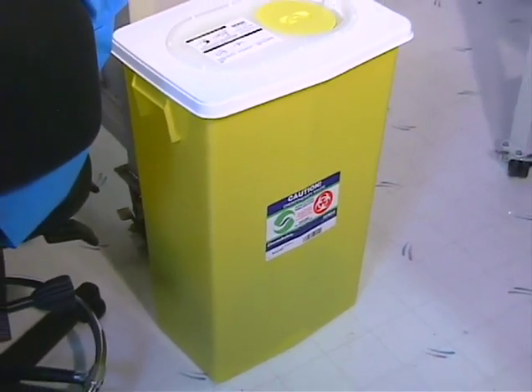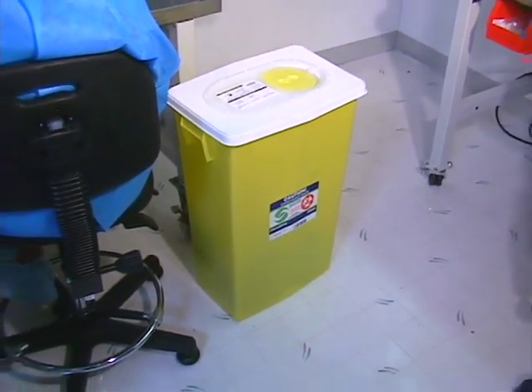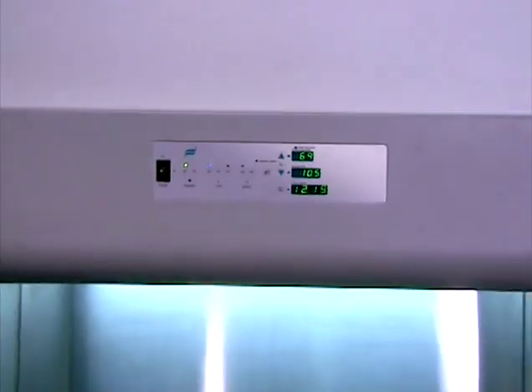A large chemo disposal container should be available immediately outside the BSC. The hood must be running during cleaning procedures because you will be disturbing any chemo residues present, and proper inflow velocities are required for your protection. Do not open the sash above the marked height.